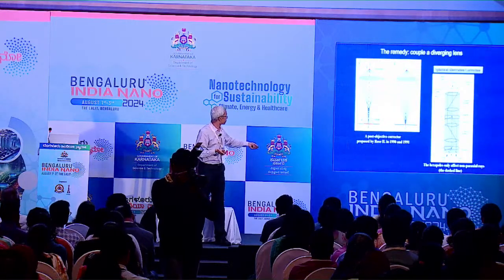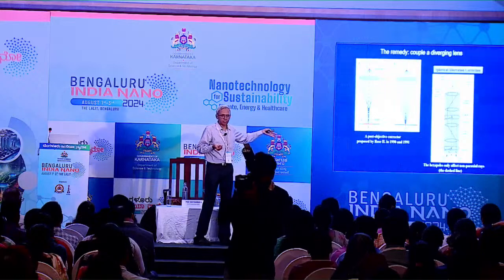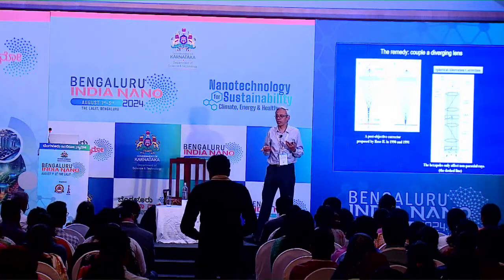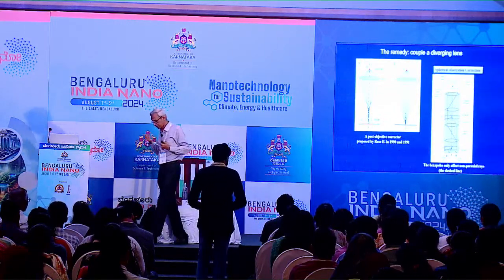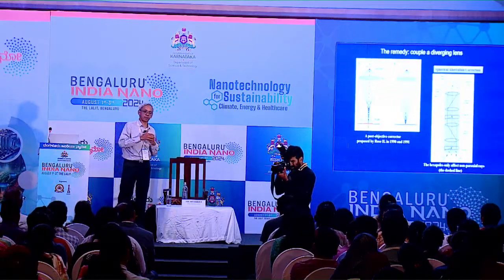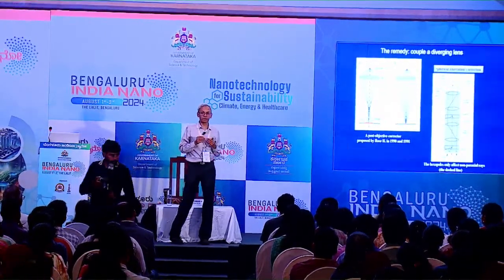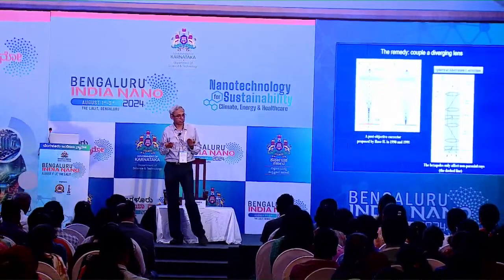In the modern generation of microscopes, this only happened in the late 90s or so. The first aberration correctors appeared, and that is why it's now possible to have sub-angstrom resolution in the electron microscope, which enables us to see things that were absolutely not possible to see before. That is absolutely critical and important for characterizing and understanding materials and nanostructures in particular.